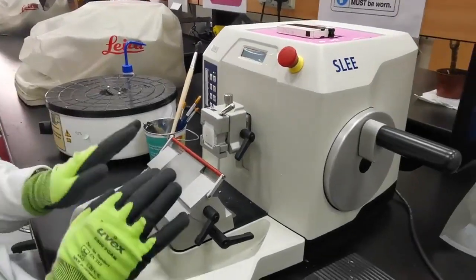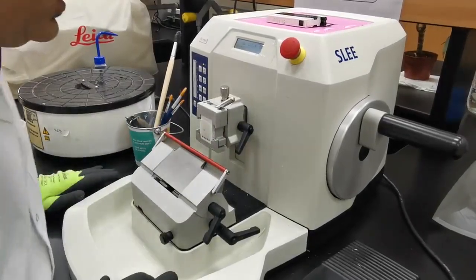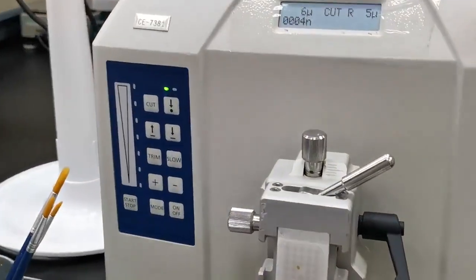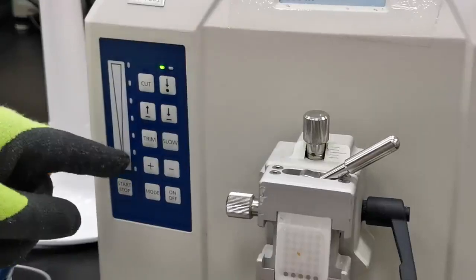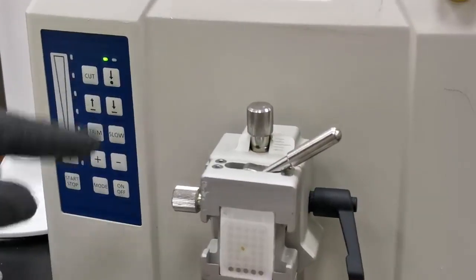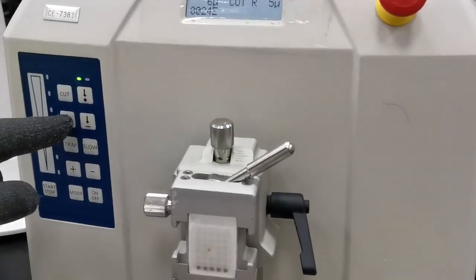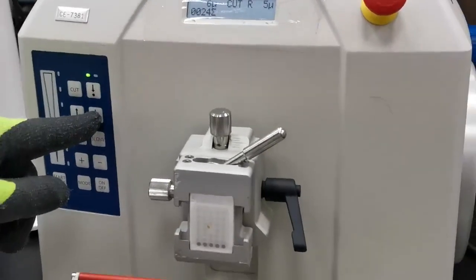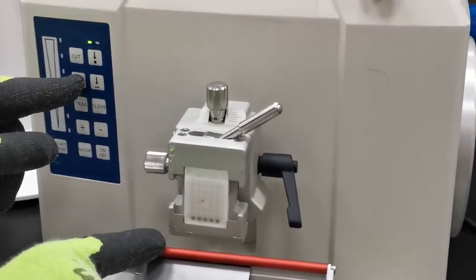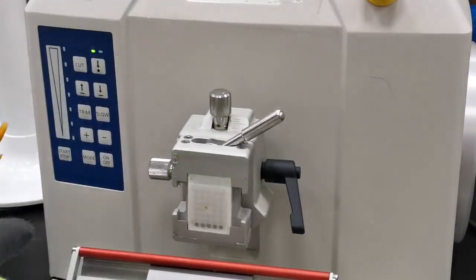Now that we've talked about the knife holder and block holder, let's look at the electronic controllers. Here we can control the speed — I'll show you when it's on: faster, slower, cut mode. These forward and backward arrows allow you to control the advancement of the block in relation to the knife electronically.